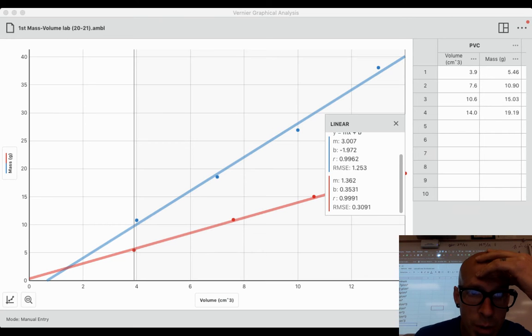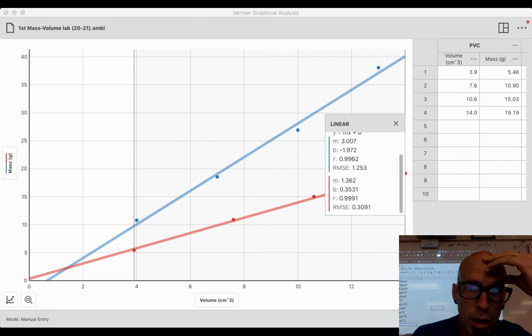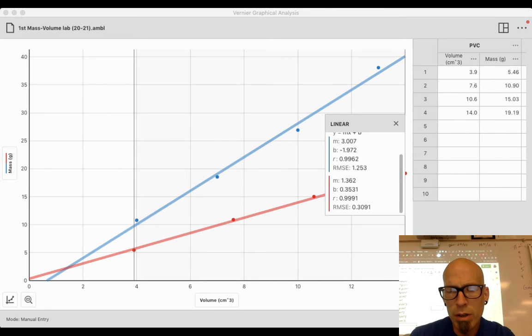Now, everybody with aluminum, with the exception of me, I guess the 2.89 is up there a little bit closer to 3, but in a 2.6 something range or 2.7. So very close to 2.6 something, upper 2.6s, I guess. And then there's me. So everybody measured these things a little differently.